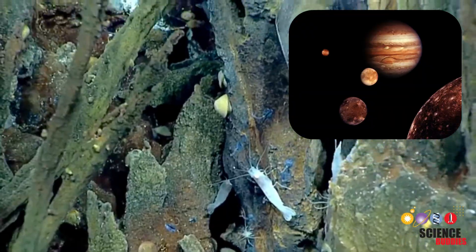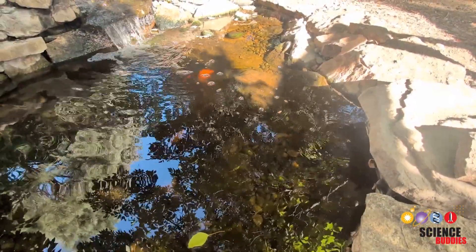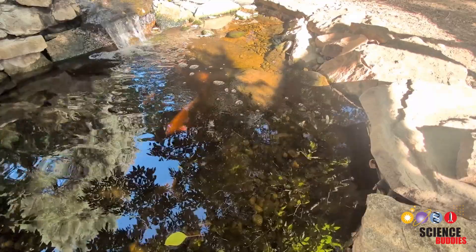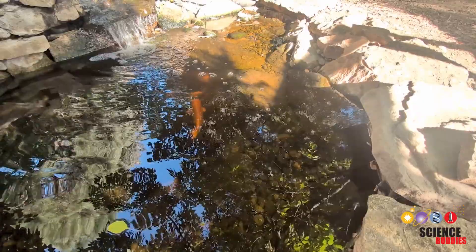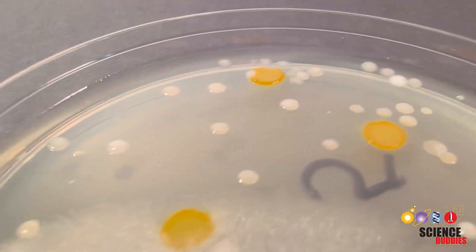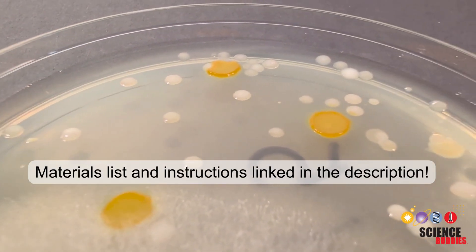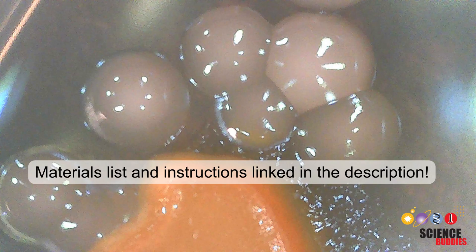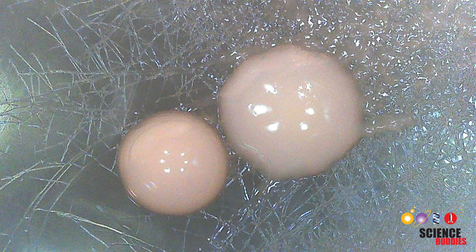In this science project you will investigate whether there are microbes in a natural water source near you that could have survived some of these early Earth conditions, including very basic and acidic waters. You will attempt to culture these microbes on agar plates, which are also known as petri dishes, and on at least some of your plates you will likely end up growing some microbes like the ones you see here.